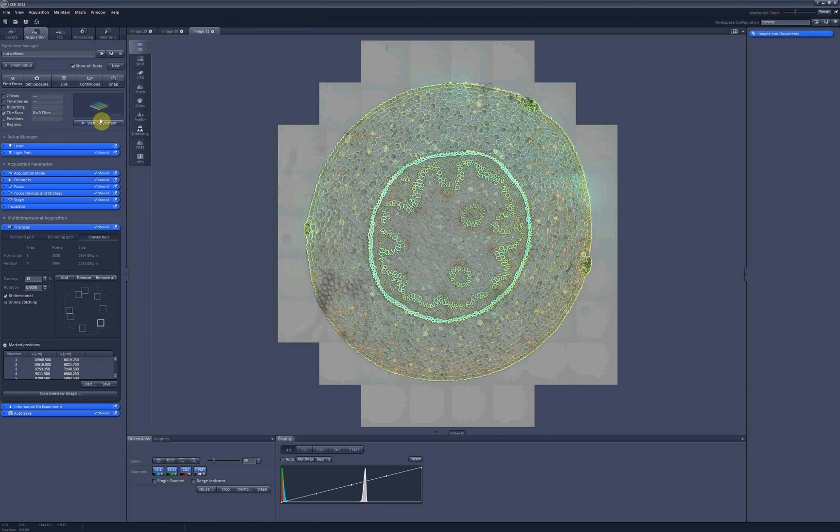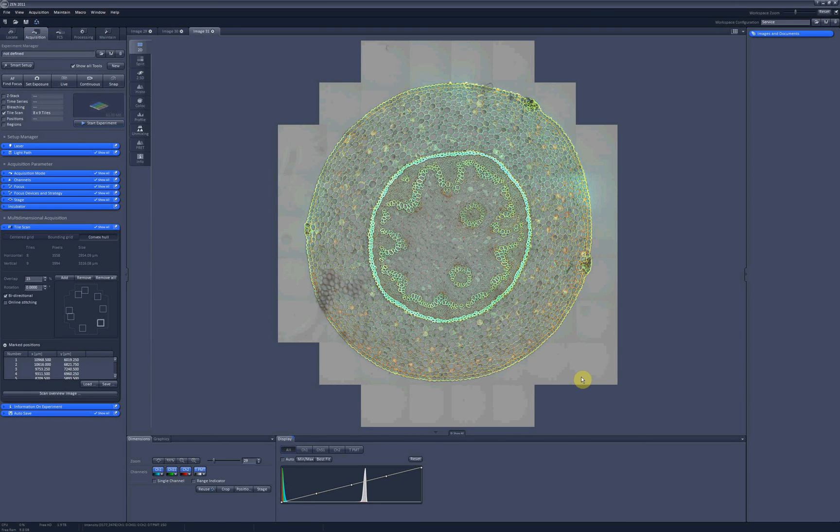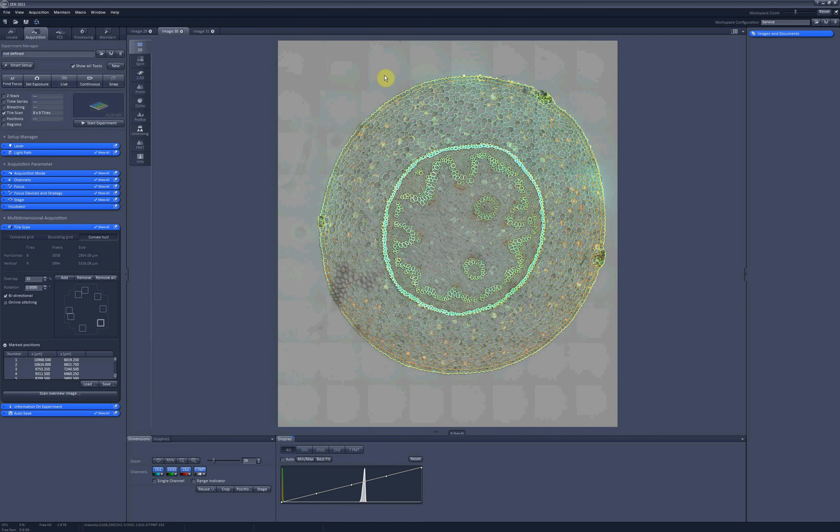The great benefit of convex hull option is that it saves you time which will be spent on scanning this area. And it also doesn't photobleach your sample as much as the bounding grid option would have done.